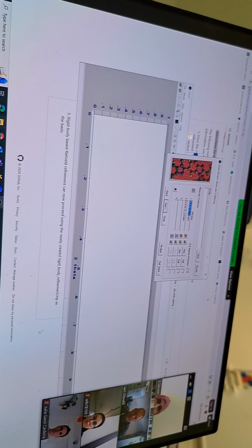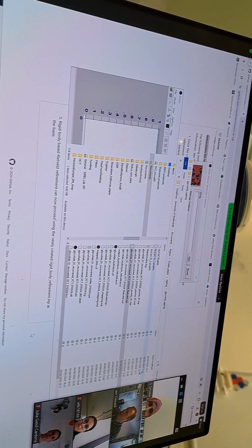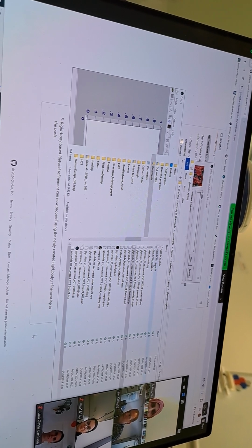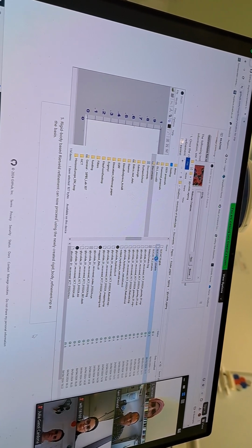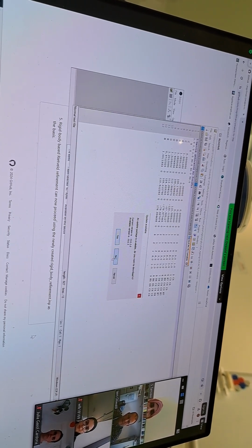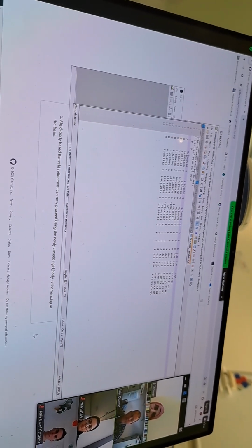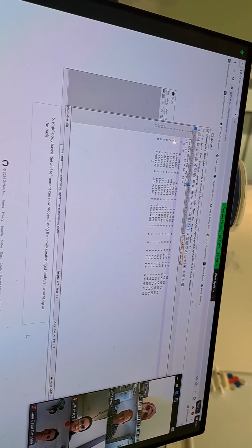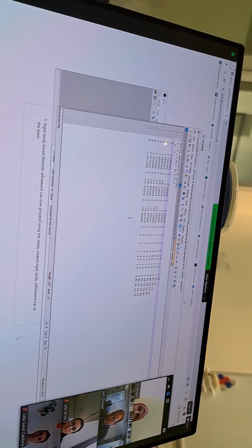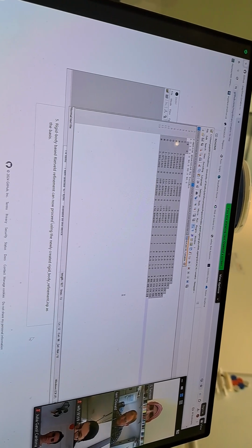And in that file structure, you will see that I produced these two files on the 8th of May. Okay. Now, if we open this up, as a reminder, we've got this setup. We've got our carbon, and then 3 columns. That's going to be our bond lengths, bond angles, and torsional angles. And this is the way that it's set up in Dash.